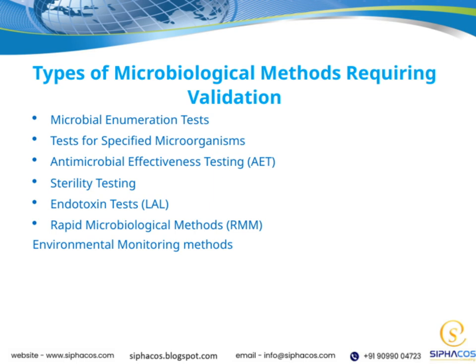Finally, it's important to note that many microbiological methods require validation. This is a critical step to ensure their accuracy, reliability, and reproducibility in our quality control processes. All these methods form a comprehensive framework that helps us maintain product safety and quality throughout the manufacturing lifecycle.